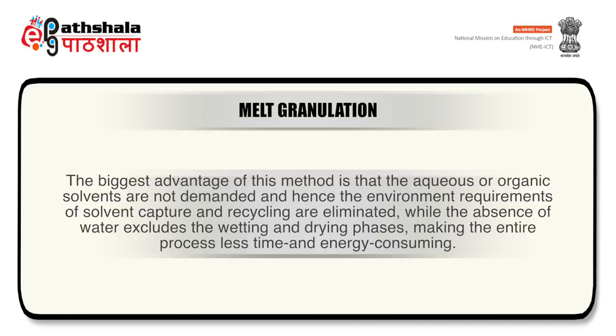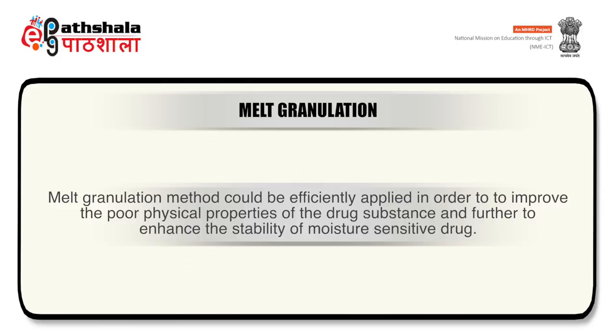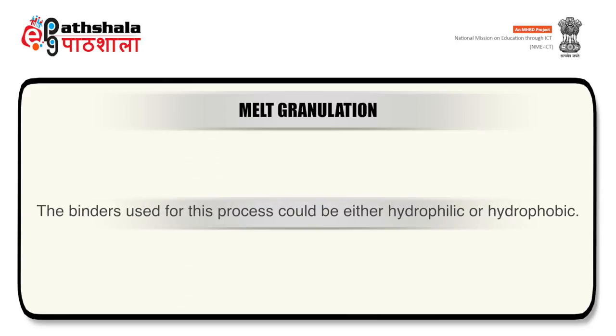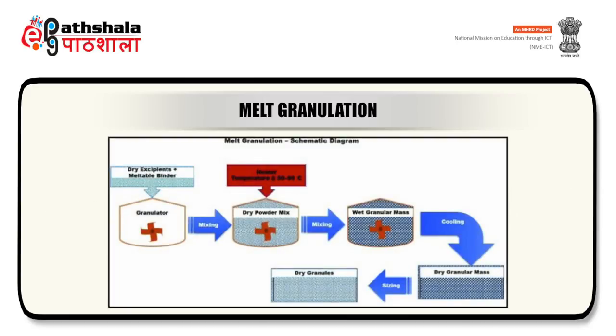While the absence of water excludes the wetting and drying phases, making the entire process less time and energy consuming. Melt granulation could be efficiently applied in order to improve the poor physical properties of the drug substance and further to enhance the stability of moisture sensitive drugs. The major drawback of this process is the need for high temperature during the process, which can cause degradation of thermolabile drugs. The binders used for this process could be either hydrophilic or hydrophobic. However, the selection of a meltable binder with a hydrophilic or hydrophobic feature is a critical factor for the dissolution behavior of the drugs. Please also refer to the schematic diagram.